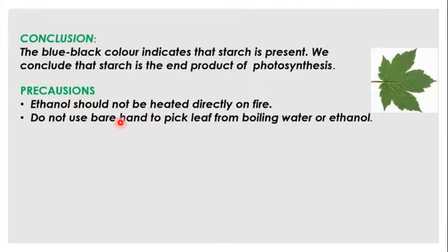Two, do not use bare hand to pick leaf from the boiling water or ethanol. I hope you know why. Yes, it could be burnt or scalded with the heat from the boiling water or ethanol. So it's not good to use your bare hand.